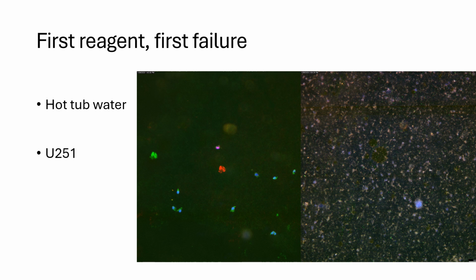I learned from this mistake that too harsh or complex of a reagent can make it impossible to interpret the results. It's much better to go with something that has more of a known concentration so you can start isolating components depending on your goals.